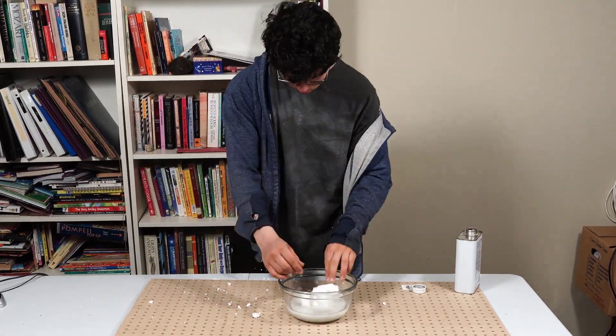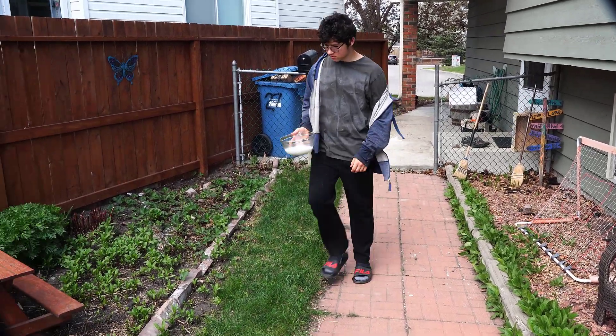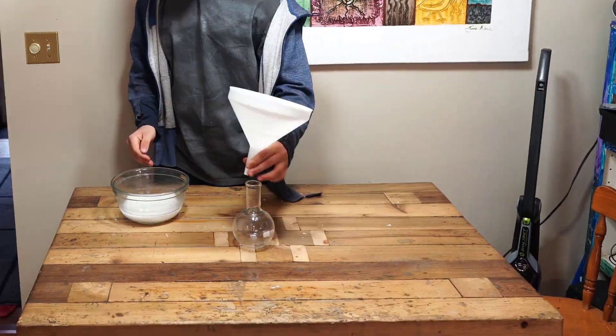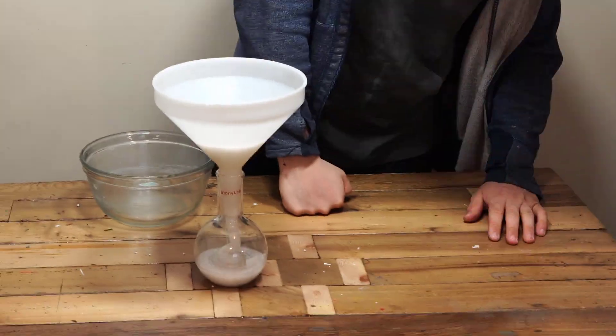Now we're going to bring the styrofoam outside in order to let the residual acetone evaporate. One hour later and most of the acetone has evaporated, and now we're going to pour the styrofoam into a glass flask.